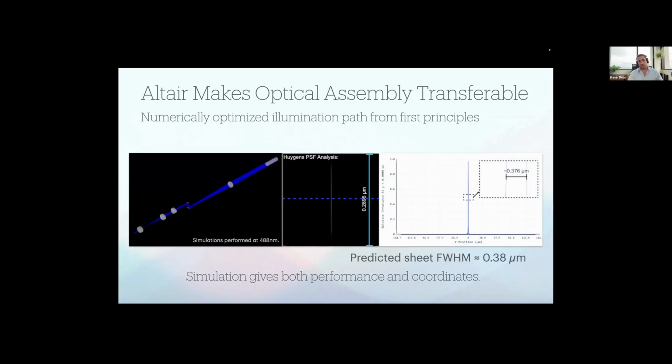So the design process is quite repetitive, but we've tried to essentially emulate what a professional, big microscope company will do. So we start from first principles and we design the system around the biological problem that we have. And then we go and say, all right, these are the lenses that we would need to achieve this field of view, this sort of light sheet diameter, light sheet extent.